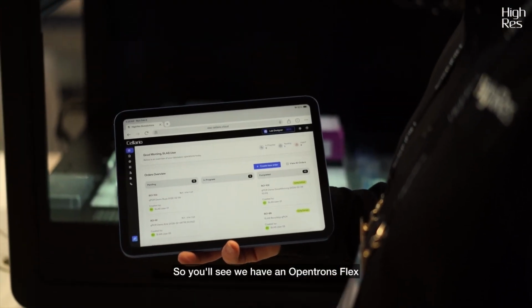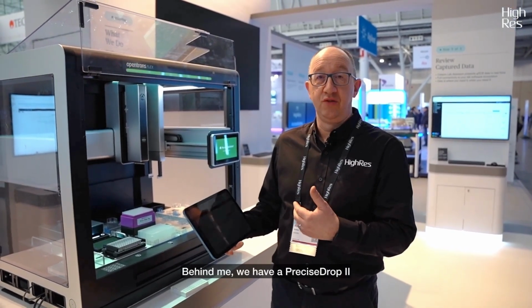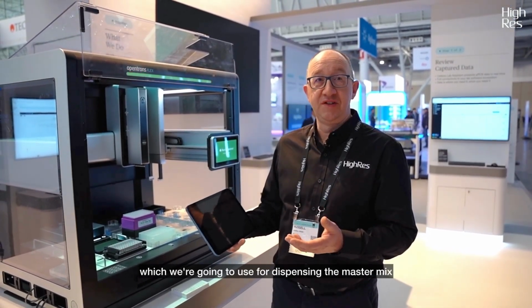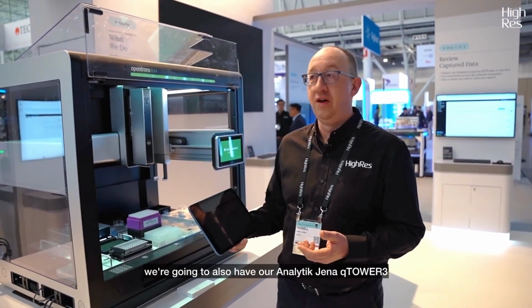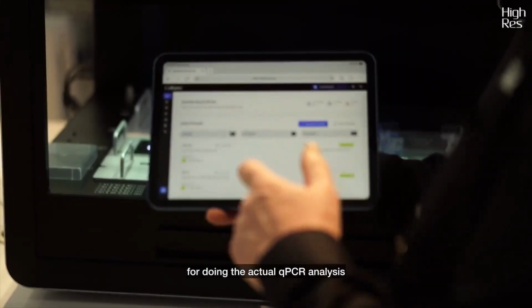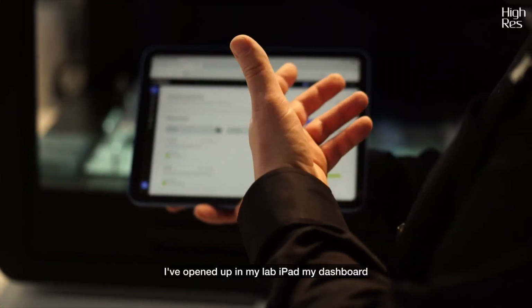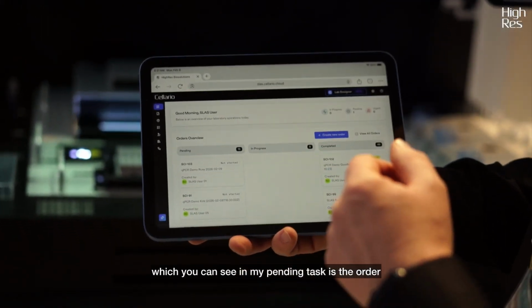So you'll see we have an OpenTrons Flex where we're going to carry out a serial dilution. Behind me, we have a Precise Drop 2, which we're going to use for dispensing the master mix. And then further along this workflow bench, we're also going to have our Analytik Jena qTower 3 for doing the actual qPCR analysis.